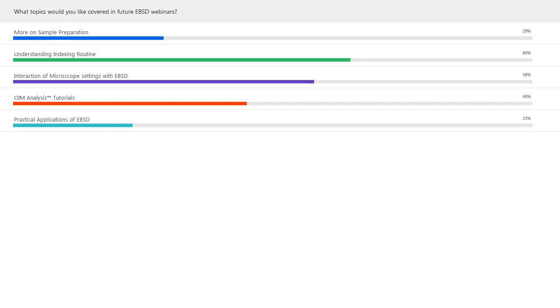So we don't need any kind of special pre-treatment for this, but again, NPAR is usually best with those samples where it doesn't matter what you do, it's just not going to be the perfect EBSD sample. Again, things like ceramics, they can be very, very hard. They can be very, very multi-phase, where there's just things that diffract differently, maybe if I have a zirconium in there or something. So these basically non-ideal samples are much easier to deal with because of that. It could be polishing, it could be diffraction strength, it could be 1,000 things, where I just can't get everything perfect, and that really is where NPAR shines.